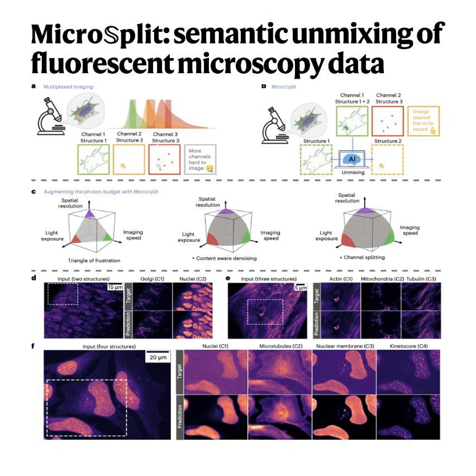How does it actually do that mathematically, though? It takes the primary high-resolution input patch, but then it systematically injects image context at increasingly lower pixel resolutions deeper into the network. Oh, I see. So it's basically feeding the AI the macrogeometry of the cell alongside the micro details. Exactly. By understanding that broad spatial layout, the big picture, it can make highly accurate semantic decisions about overlapping pixels at the high-resolution level. And the paper outlines 3 meta-architectures for this, right?